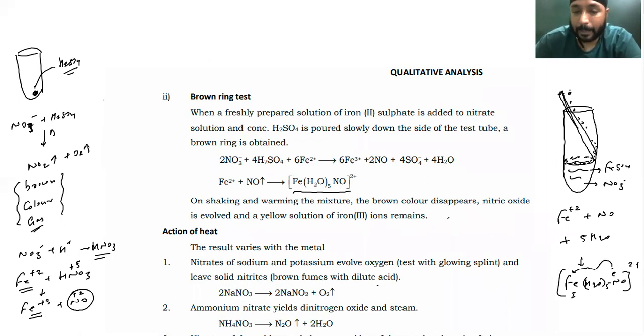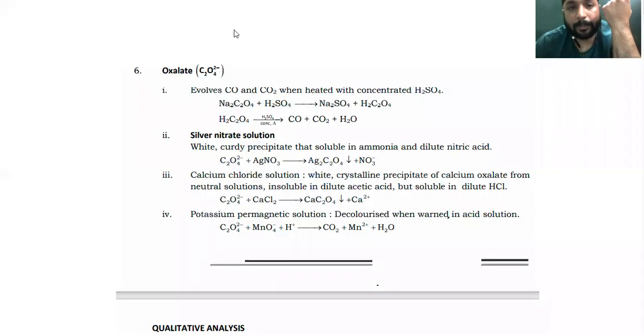Okay. Now we'll be doing the class B test. No, maybe oxalate is pending. After oxalate, we'll be doing the class B anion test. Right. Okay, now we do have a test for oxalate. There's a last anion in the category of class 2A, which gives a prelim test with concentrated H2SO4. Again, you do have an oxalate anion. Prelim test will be done by concentrated H2SO4.